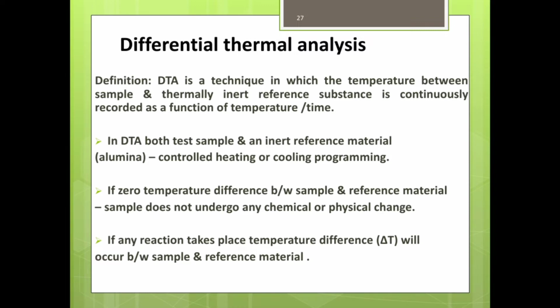At a particular temperature, the sample will change its state from solid to liquid. At that stage there is a decrease in temperature in the sample rather than in the reference. It will go on increasing with the increase in temperature. The difference between the sample and the reference is known as differential thermal analysis.